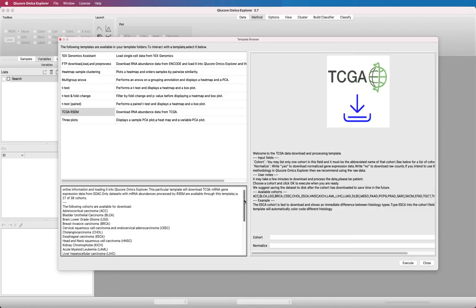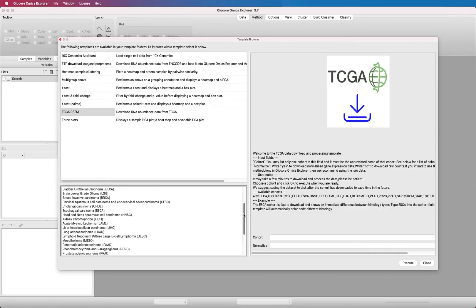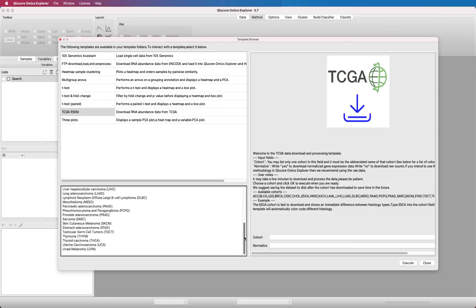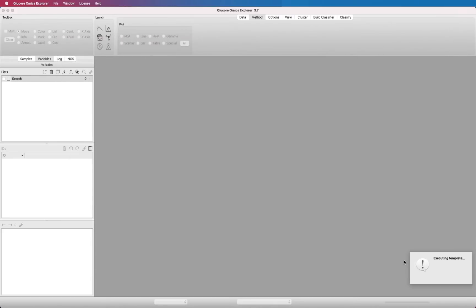As you can see, there are a lot of different cancer types represented. To download a cohort, you just type the abbreviation and whether you want to download normalized data or not. Yes means normalized data and no means that you download raw data. In this case, we select the ESCA cohort and we want normalized data. When you press execute, the downloading starts.